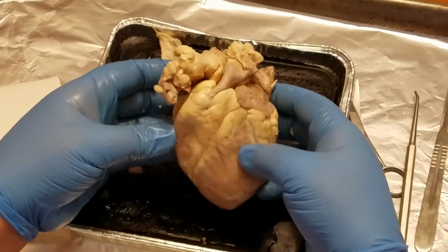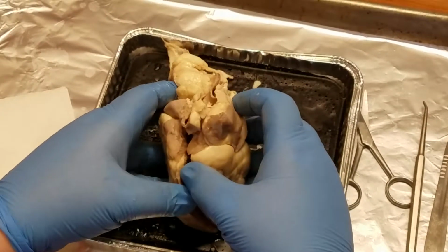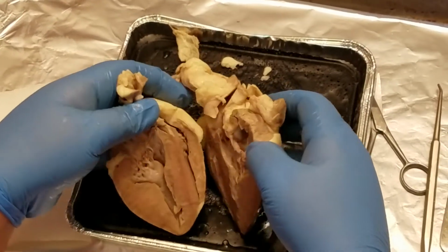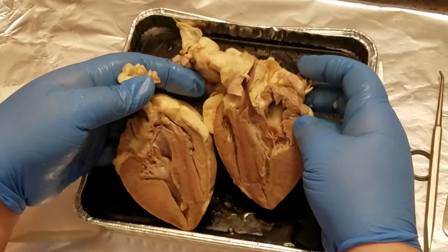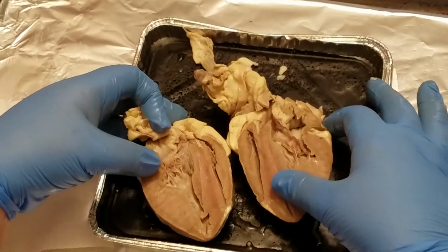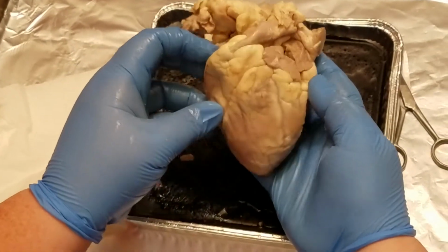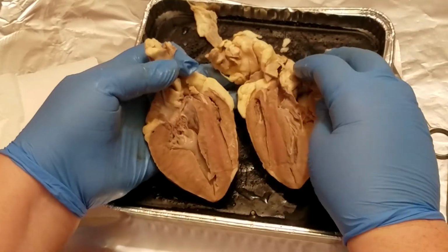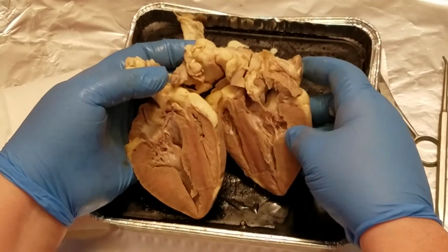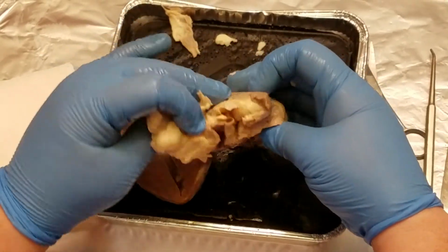All right, so I cut through the heart and I just cut into the right atrium, and was having a hard time, so I ended up doing not a completely even frontal cut. So as it is shown here, this is the anterior portion of the heart that I've got here. And because I didn't do an even cut, it's a little bit easier to show on this one here.